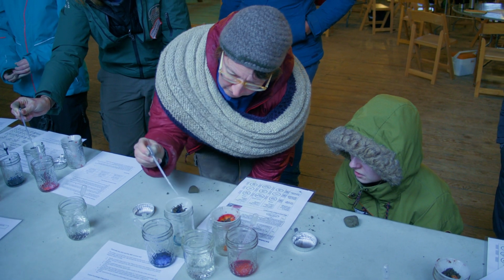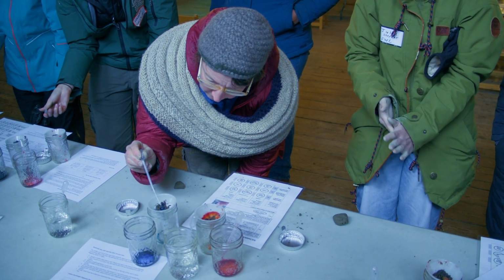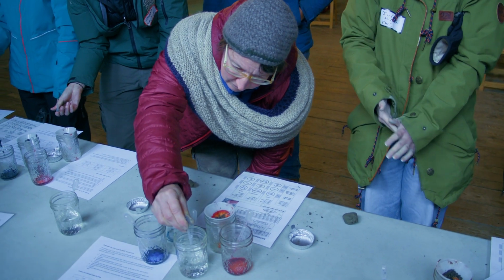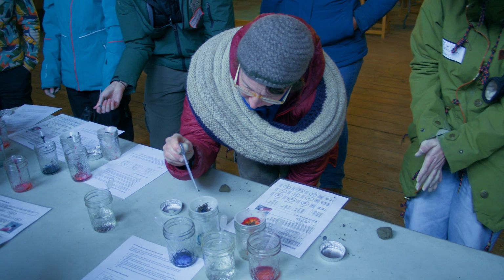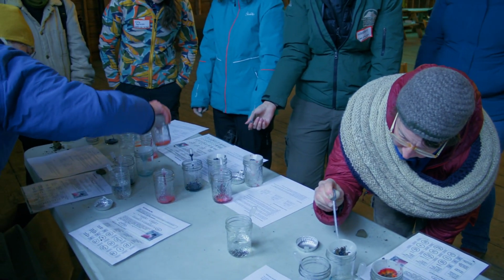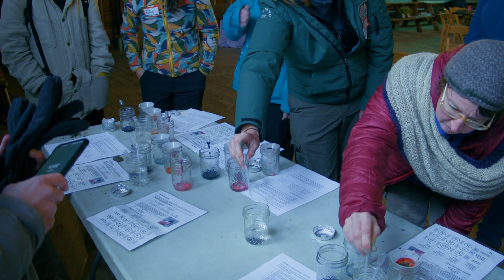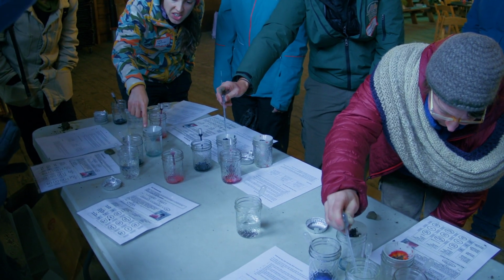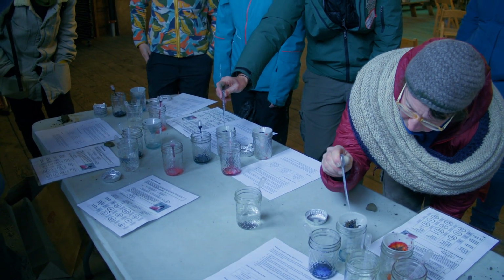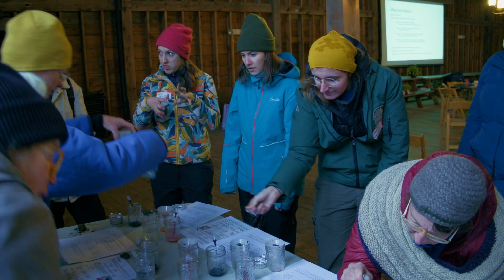Right. What kind of texture did you guys have? We had silty clay, I think. And so is that kind of similar? How did the silty clay cation exchanges compare? What was your blue one looking like? Oh wow, look at that. Is this your blue one? Yeah. Wow. Yeah, so a really high cation exchange capacity. It's really holding on to that dye in the soil.